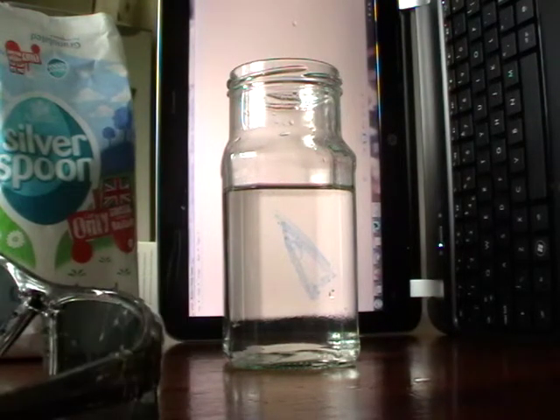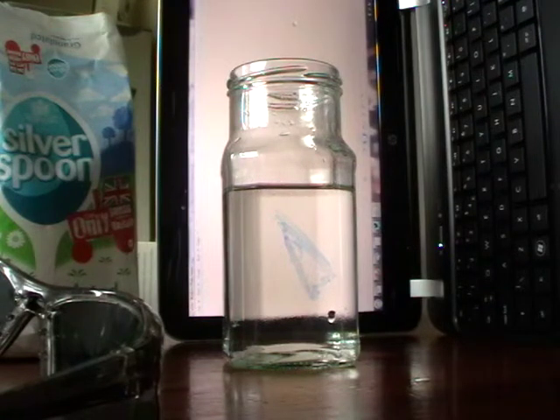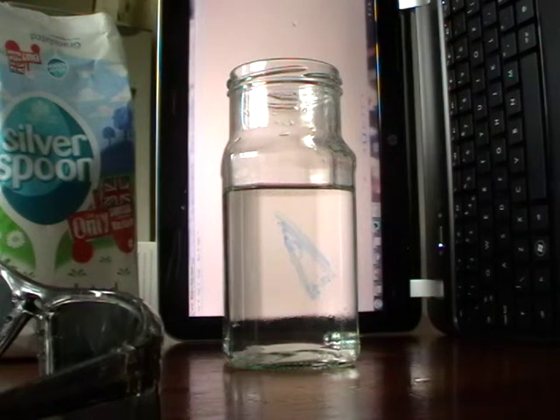Now apparently, if you use a mixture of fructose and glucose — which you can make in two different ways — then you can get the light to rotate the other way, so you can even extend this experiment a little bit. You can dissolve honey, which will give you that. Or you can take your sugar solution, add a bit of lemon juice, and do a hydrolysis reaction on it, which will be really good for your students to do if you are in a lab. It can get a little bit elaborate and you do have to heat it up to significantly over 100 degrees in order to get any real conversion, so it is something that needs to be done with care.